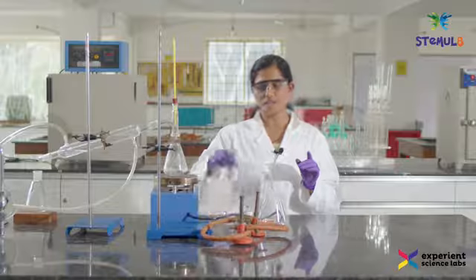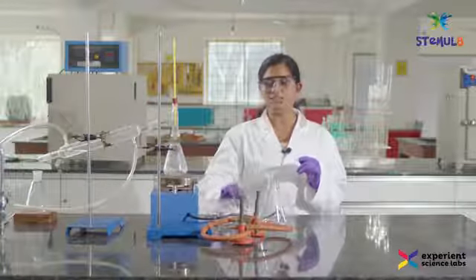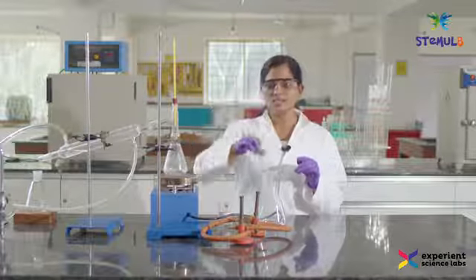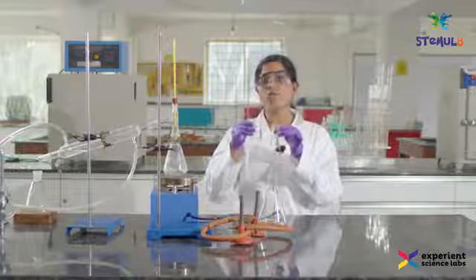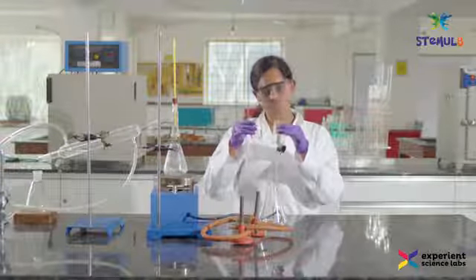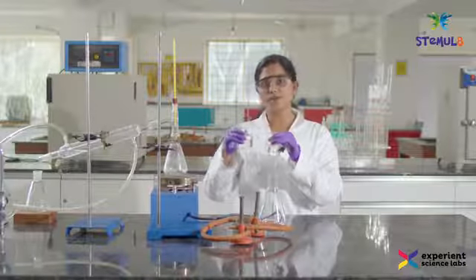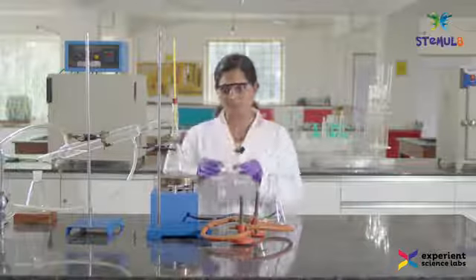So here I have 50 ml of water taken in this beaker and this is ethanol, around 50 ml, in this beaker. I'm going to mix both of them together and we are going to get a homogeneous mixture which just cannot be separated easily. So we are going to do it with the help of fractional distillation.